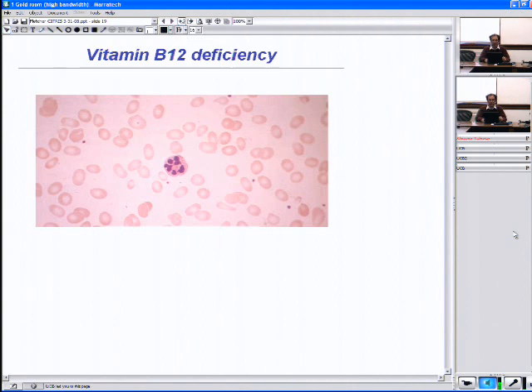So imaging is still very relevant for screening and, in some cases, diagnosis. But all of this is done in clinics where the kind of microscopes needed to take these images are readily available and where there are experts who can make this positive diagnosis.